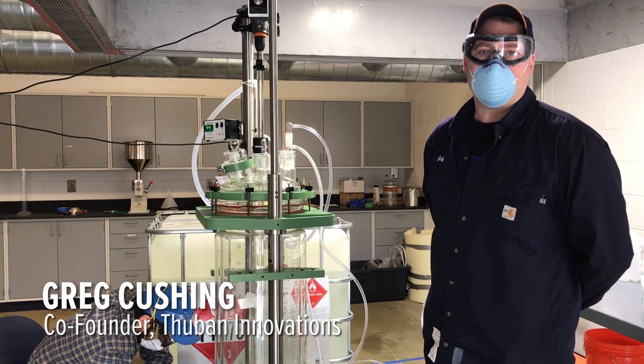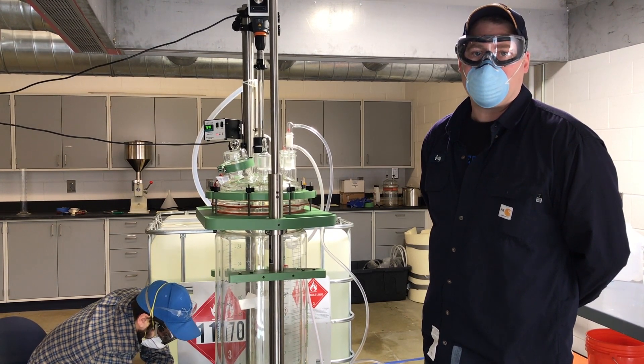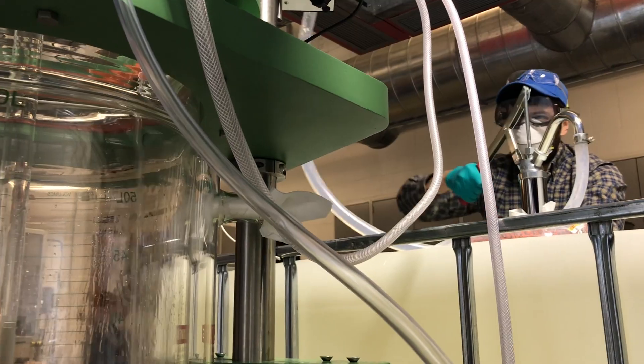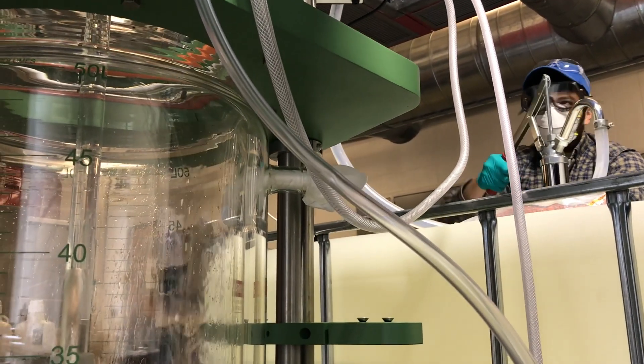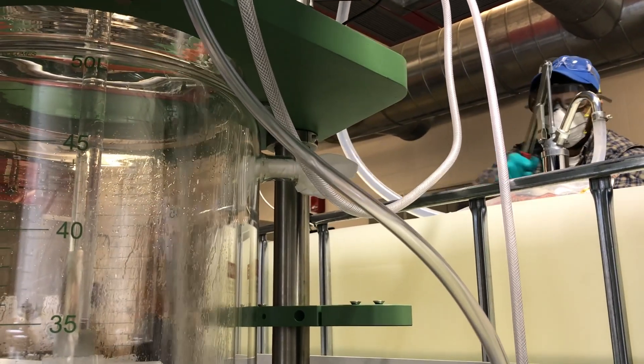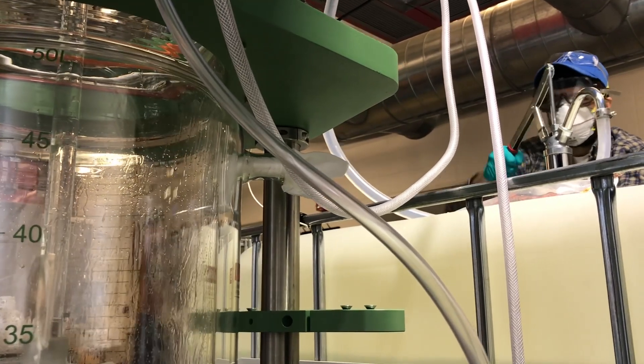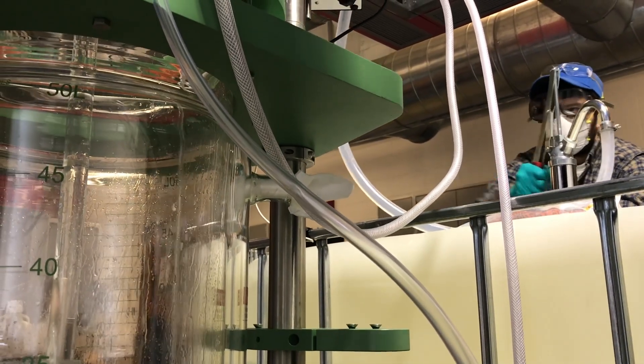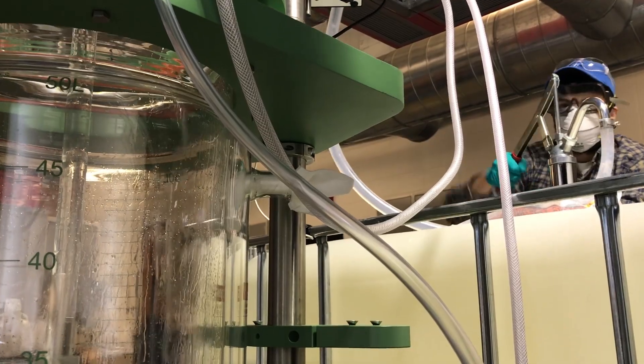We start with an empty vessel and fill the reactor with nitrogen gas to keep the flammability of the ethanol lower and ensure we don't have any safety issues.